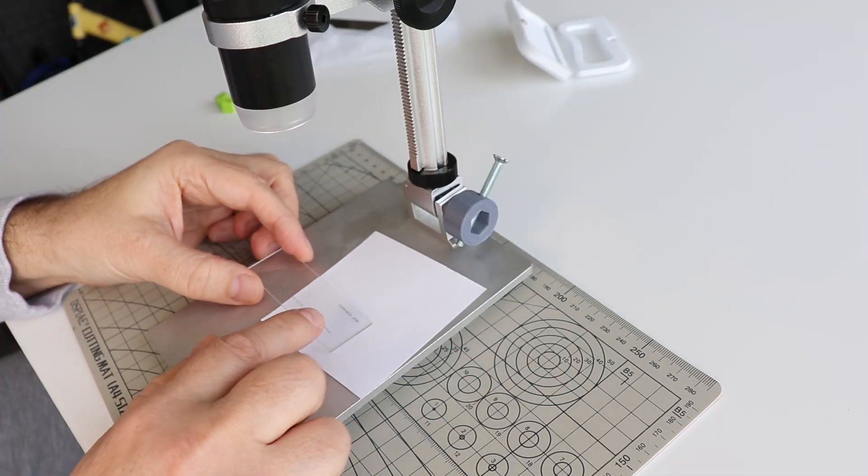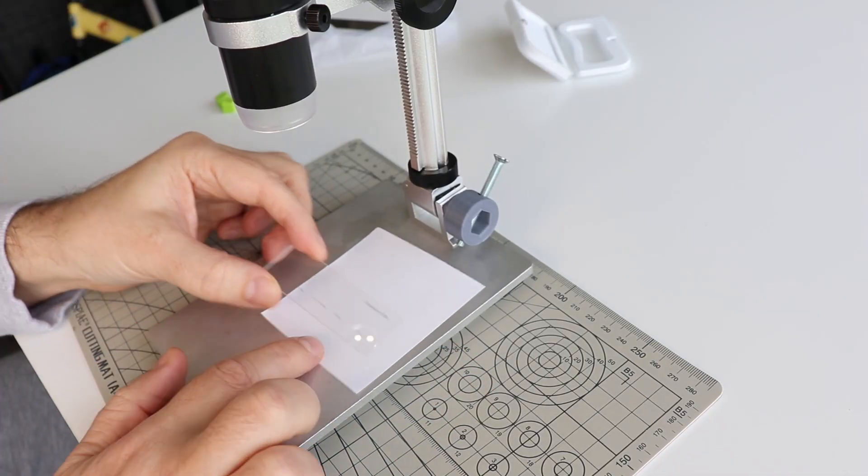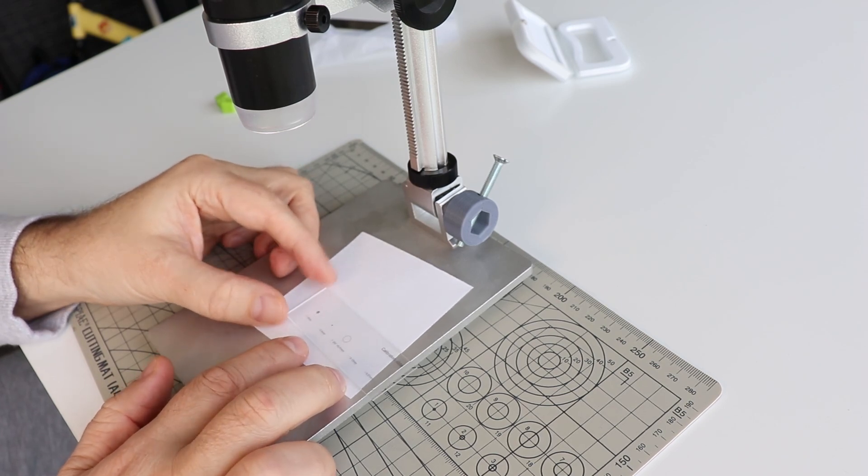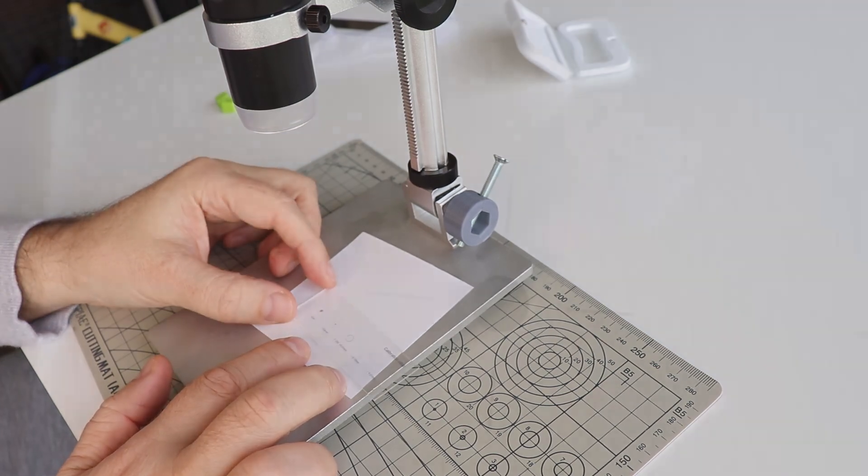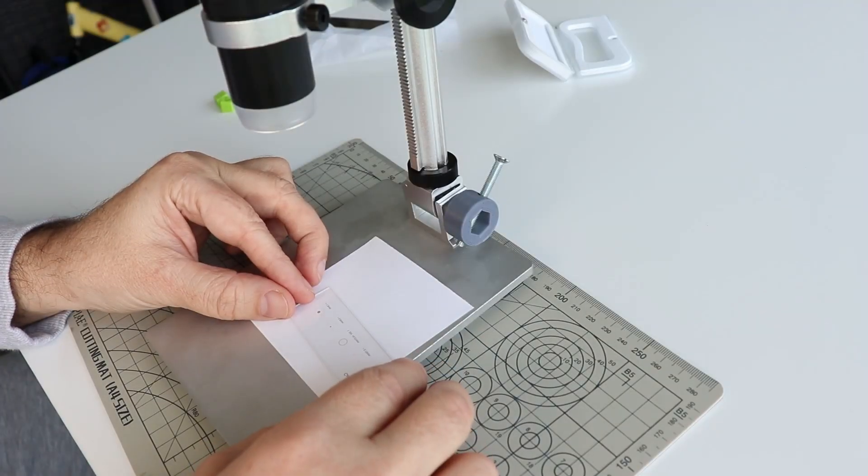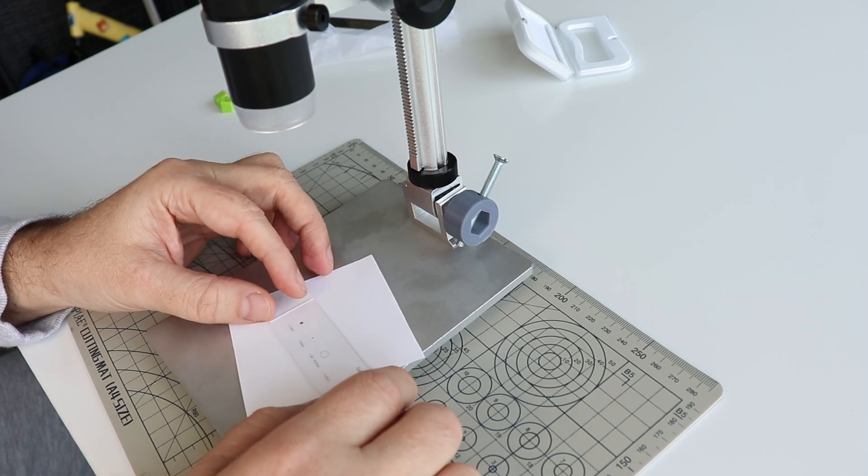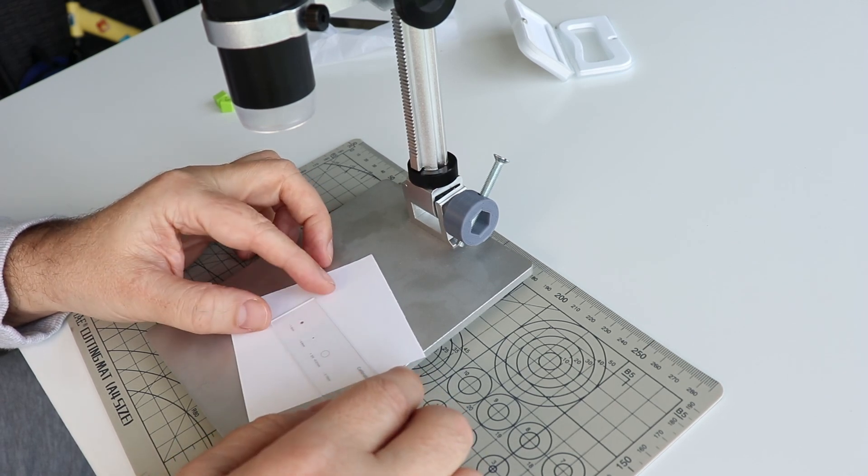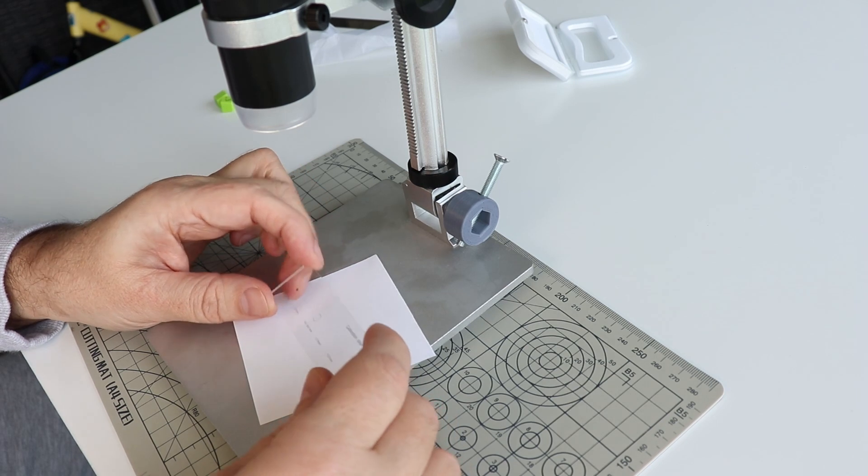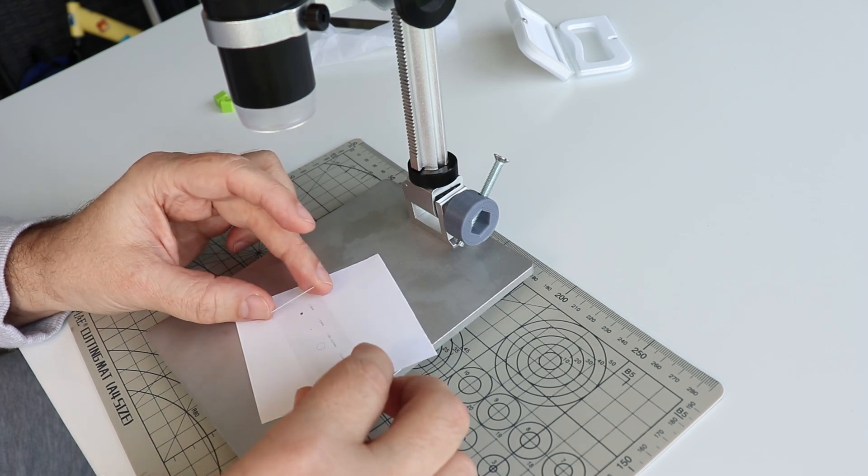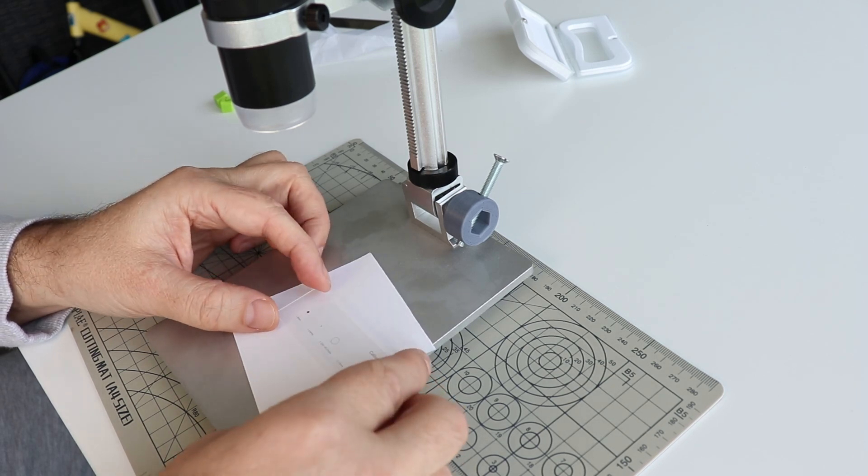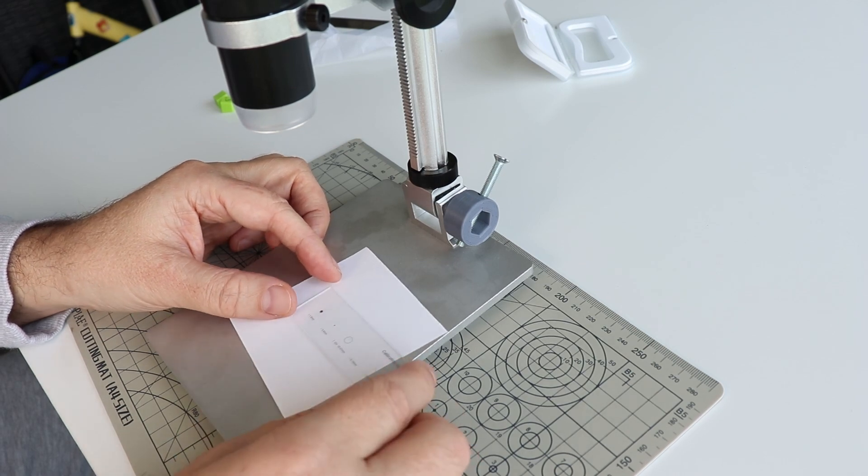It's very important, there is a reading it says calibration slide and the painting is on the top of this glass. And now maybe you can see a small shadow and if I turn it upside down there is no shadow so this means it is painted on top. In this case I have to place the object on the top or if I want to use it on top of some object then I have to turn it back to avoid some parallax error because of the thickness of the glass.